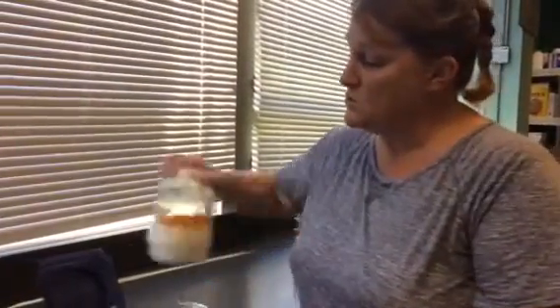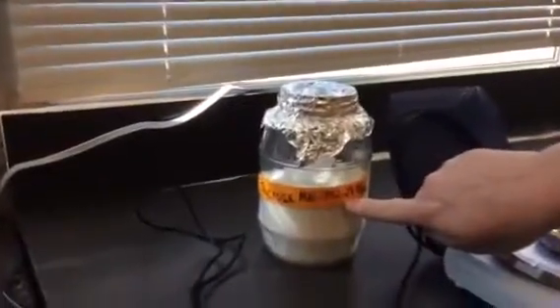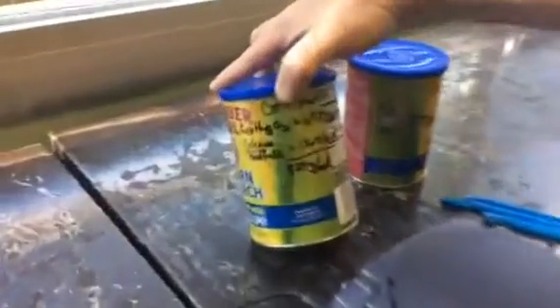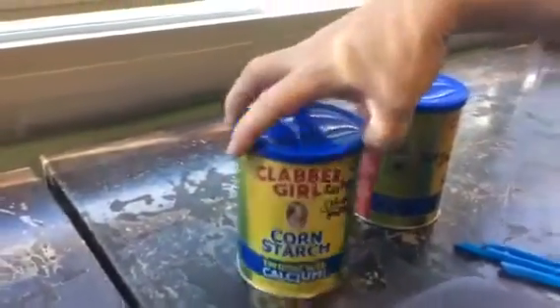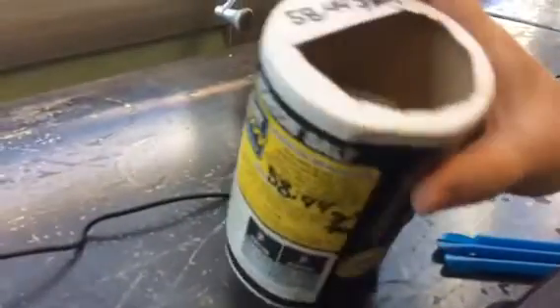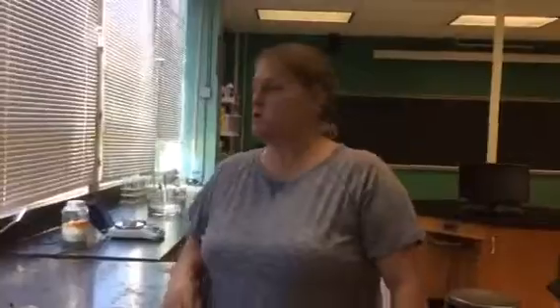You are working with sucrose, which is at your first station. It has a molecular weight of 342.29 grams per mole. Cornstarch, with all of the contents, we've got 829 grams per mole, and then salt, which is 58.44 grams per mole. So you're going to need to work with that, and again, the stoichiometry you'll be helped with.